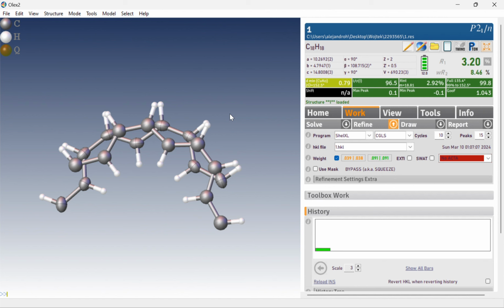And what was wrong in this case was that disorder was not refined. It's a beautiful example of how, well, you'd say it's just some disorder, it probably wouldn't change a lot. It does. In this case, it changes everything. So it's very important to refine disorder and to refine it properly. Thank you very much.